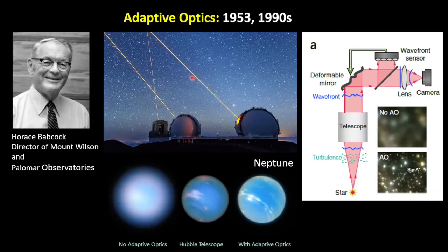This yellow laser you see is actually a sodium laser used as a guide star for adaptive optics correction. When they use this laser as a guide star and then use a deformable mirror to correct for the distortion, you get a much sharper image. This is different from deconvolution. It is based purely on adaptive optics technology.